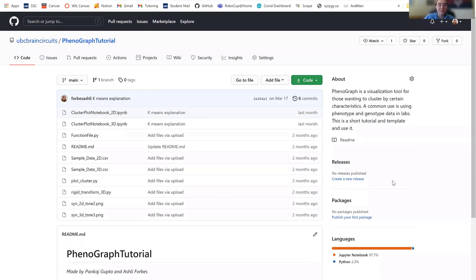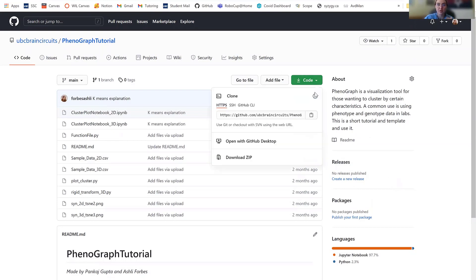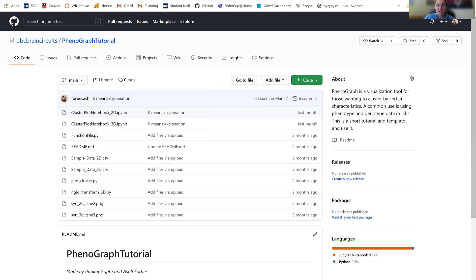So first things first, you're going to come to the GitHub and you're going to download the repository in a zip, preferably in a zip file. After that, you're going to open it up in Syzygy and then I'll show you how to go through each of the individual steps to obtain the result that you are looking for.